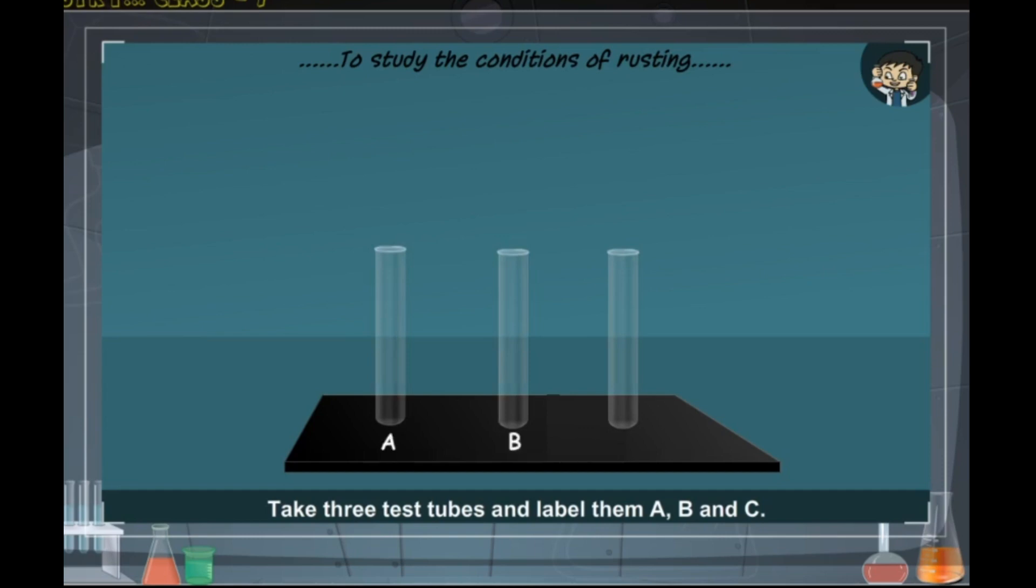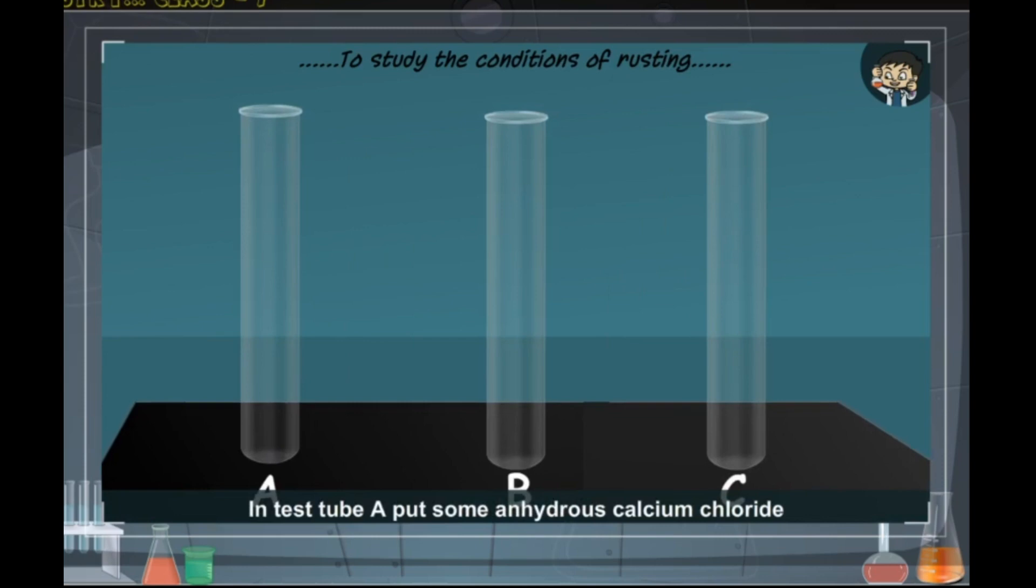Method: Take three test tubes and label them A, B, and C. Test tube A: In test tube A, put some anhydrous calcium chloride along with a few iron nails.